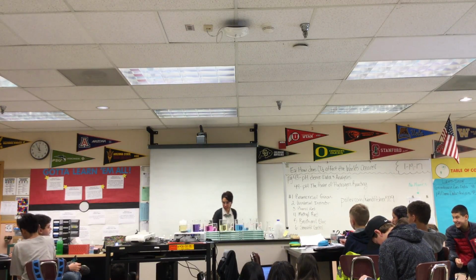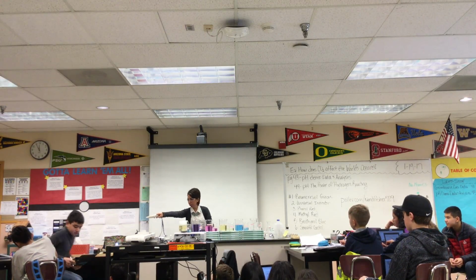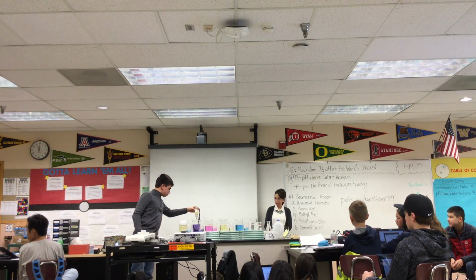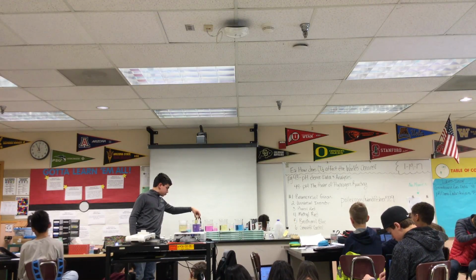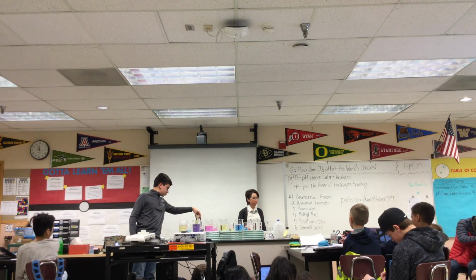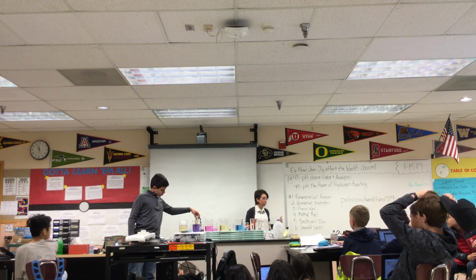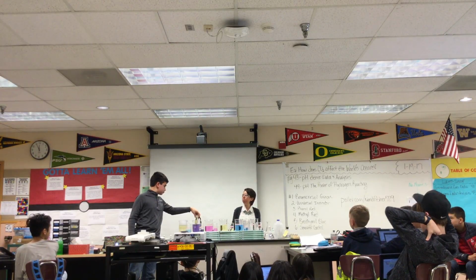All right, universal indicator. In fact, will you be my pH man for a second? Will you find the pH of the universal indicator for me? Ready? Right. Second one right there. Xander's gonna find our initial pH. What other observation should we take for universal indicator? Purple. It's purple. What else? Transparent as well. Why do you think universal indicator gets the name universal, looking at that chart? Because it spans across the whole chart. It expands the longest way. So this one is going to provide a large amount of color change, as long as we can get it acidic enough.